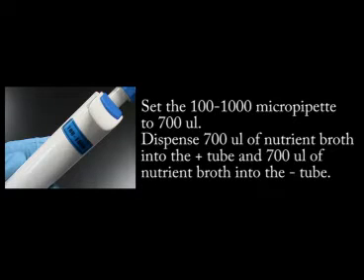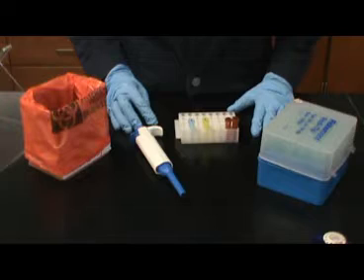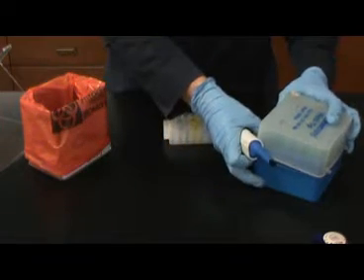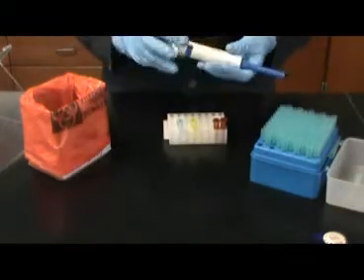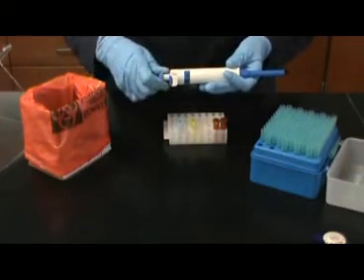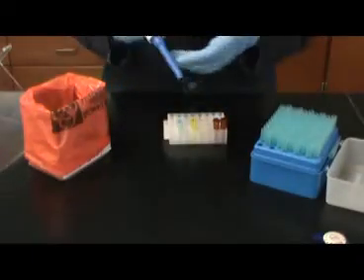For the next step of the experiment, you will again need the 100 to 1000 micropipette. You will need to set it to 700 microliters. For this part of the experiment, you will now add 700 microliters of sterile nutrient broth to each of the microcentrifuge tubes. This will provide the nutrients necessary for the recovery phase of the experiment. It is during the recovery phase that transcription and translation of the pUC18 plasmid will begin.